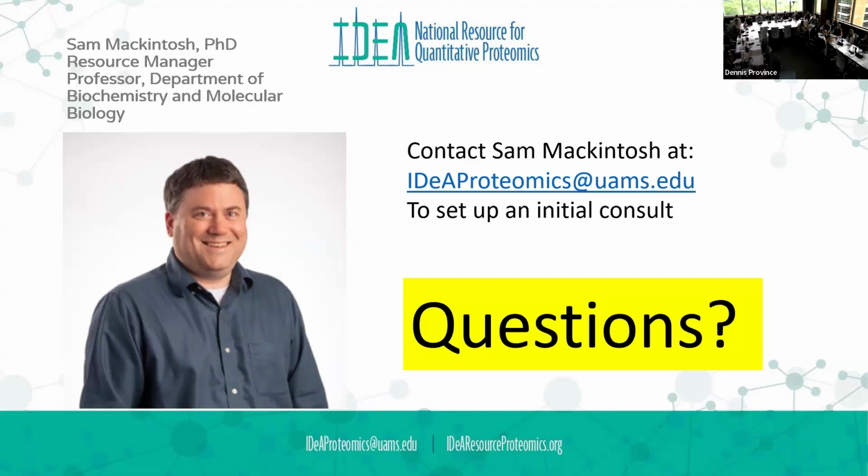Really the only customers that we have that still do TMT are because they've done TMT for a while and they don't want to switch. But yeah, that's a great question to have with them right now. If you're going to go phospho, though, that has been the reason why we still have the TMT.